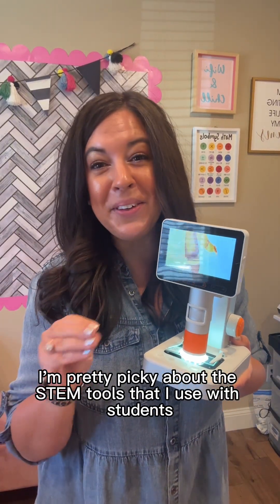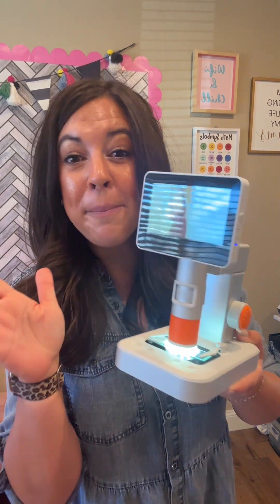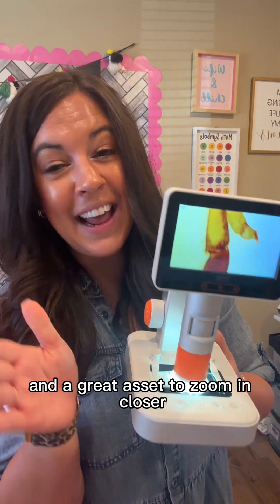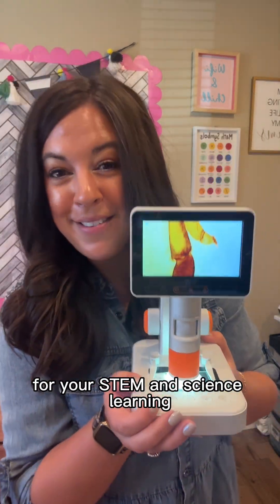I'm pretty picky about the STEM tools that I use with students for good reason, but this is definitely a microscope that I would recommend and a great asset to zoom in closer for your STEM and science learning.